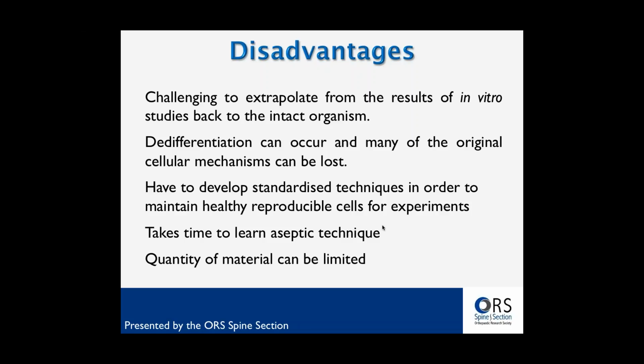The quantity of material can be limited, especially when taking biopsies. So this has been a big problem in terms of the results that we get in the literature. When you get something from a biopsy, you need to expand it. And when you expand the tissue that you get, in most cases we don't even know what we are getting. And when we expand those cells in culture, there are population doublings, etc., and then maybe they are de-differentiated at the time that we start the experiments. So these are some of the disadvantages.